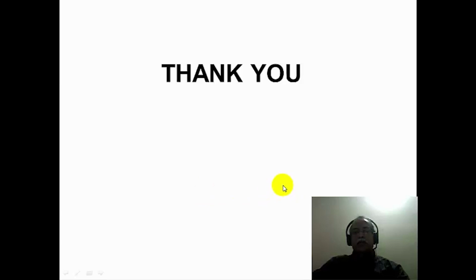Now what we have seen in this module is a tutorial session trying to solve some problems based on the mass spectrum. The most important thing is that we have demonstrated how isotope substitution reactions can be conveniently studied by mass spectrometry. We have 3 examples of isotope substitution. The first 2 examples are deuterium substitution on toluene and benzene, and the third example is oxygen 18 substitution in an esterification reaction.